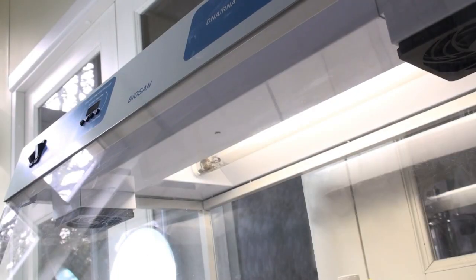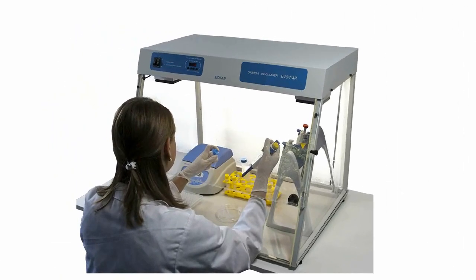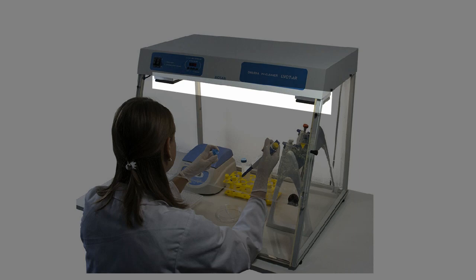A daylight lamp provides proper illumination of the working surface. UV cabinets are equipped with a flow-type bactericidal UV cleaner recirculator AR.